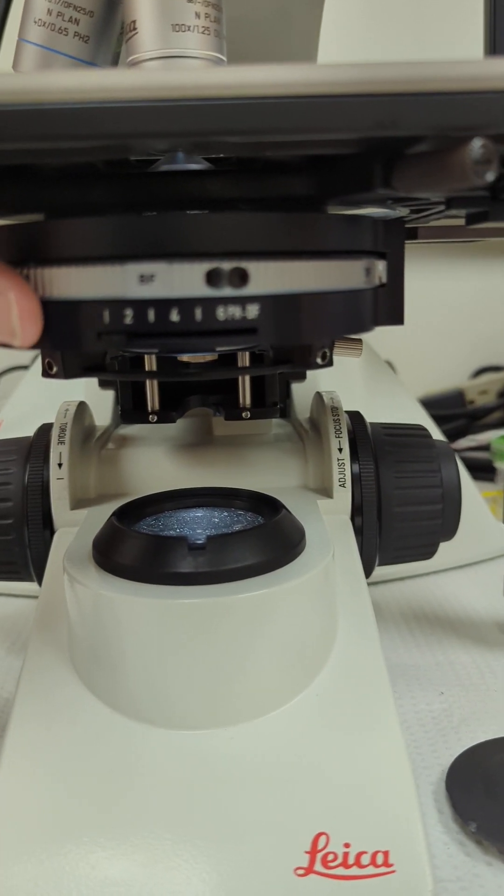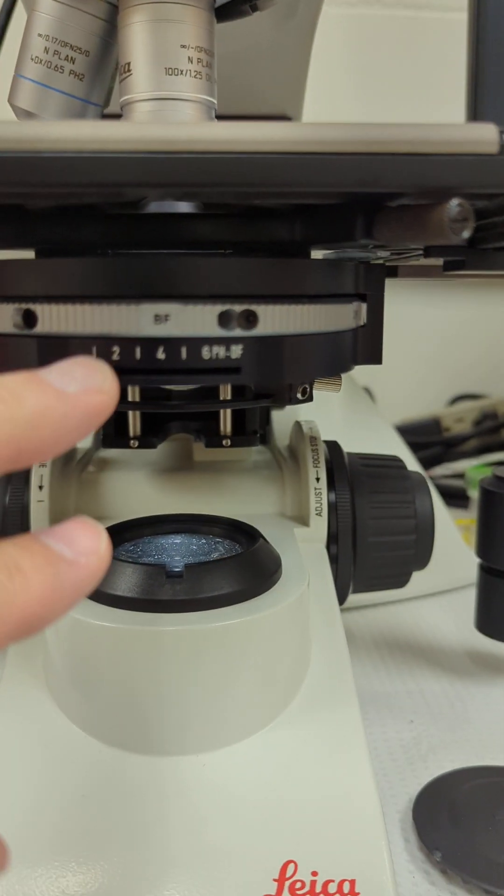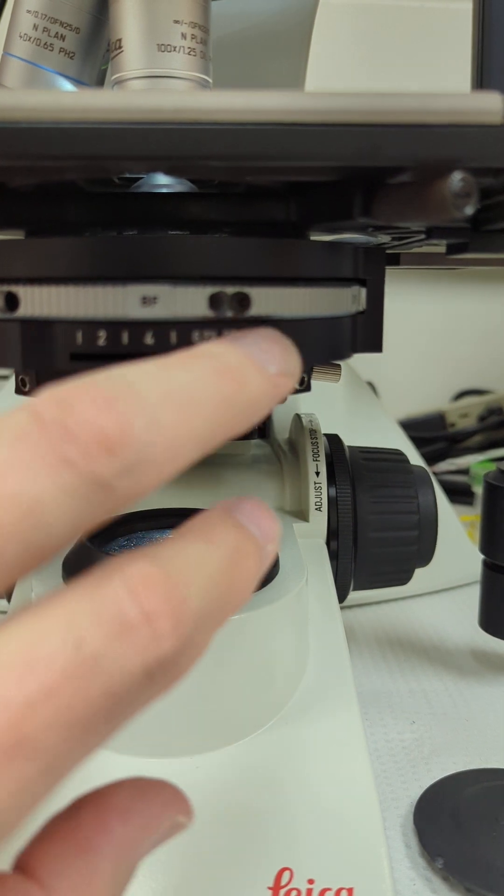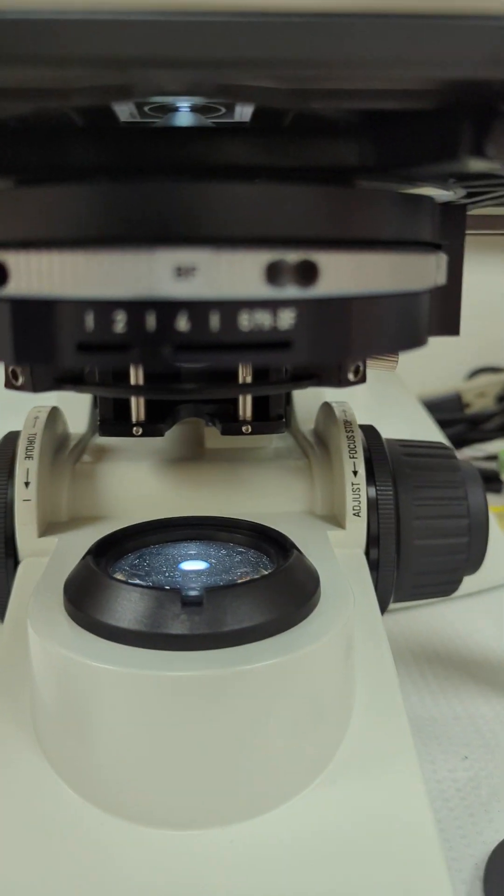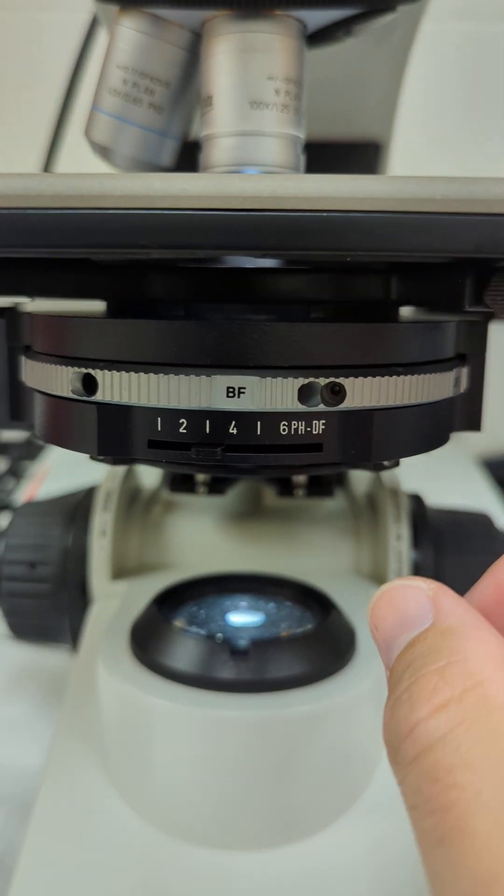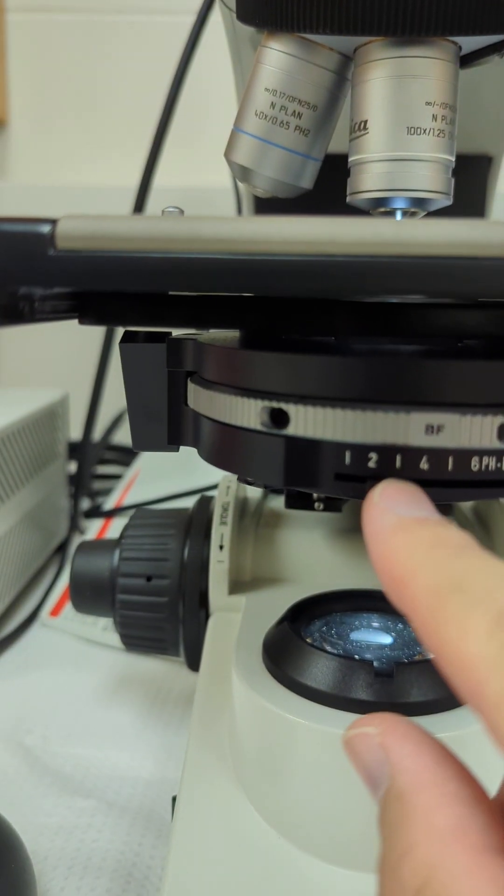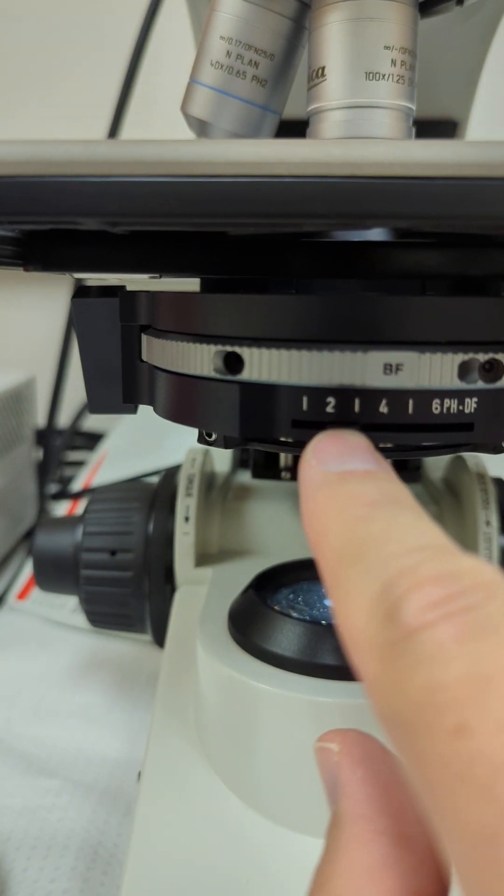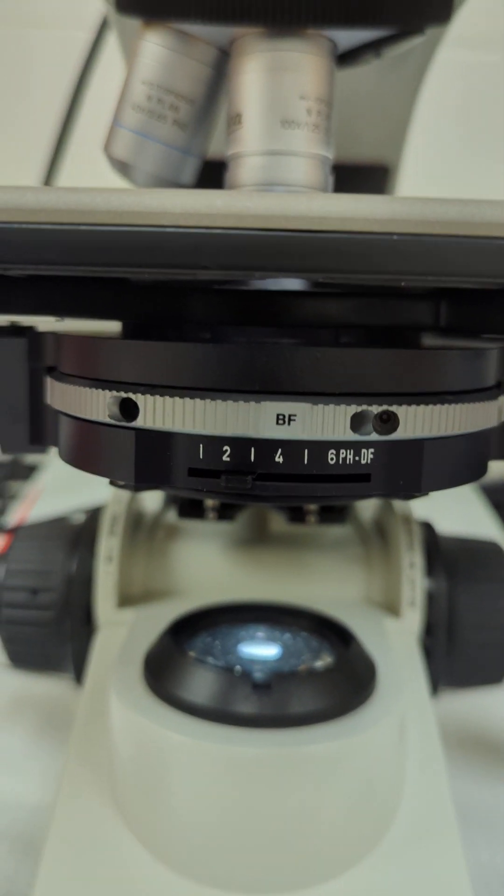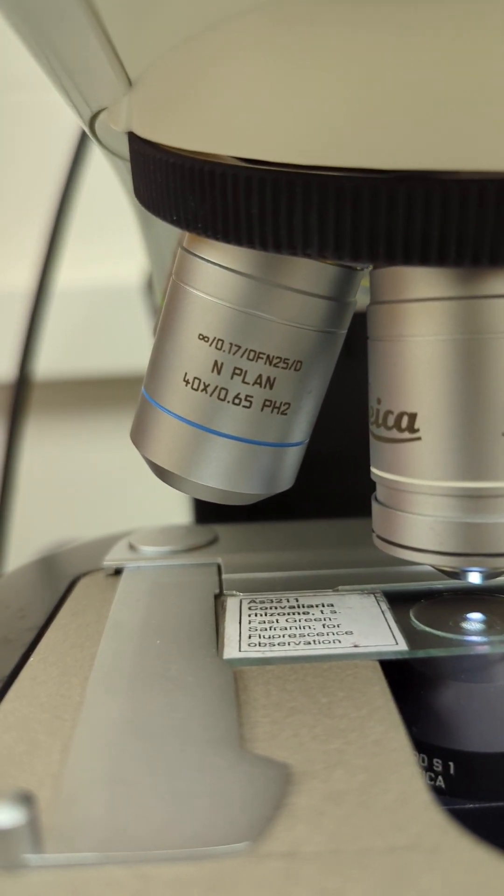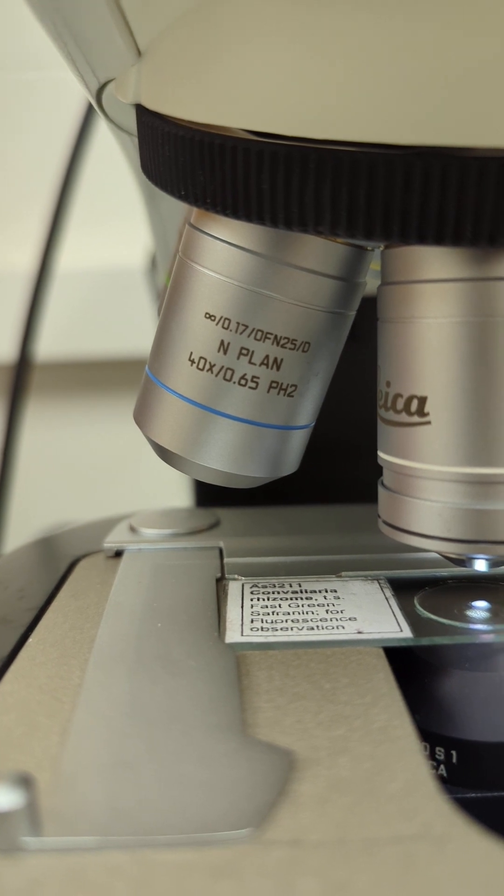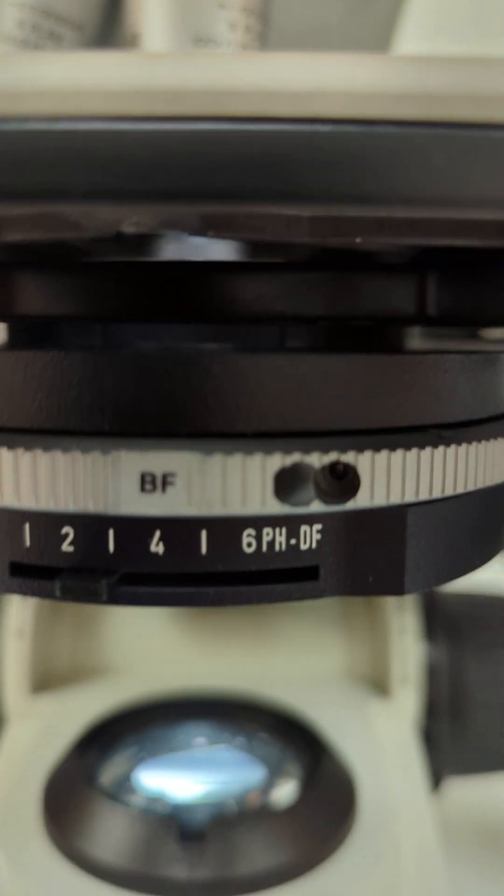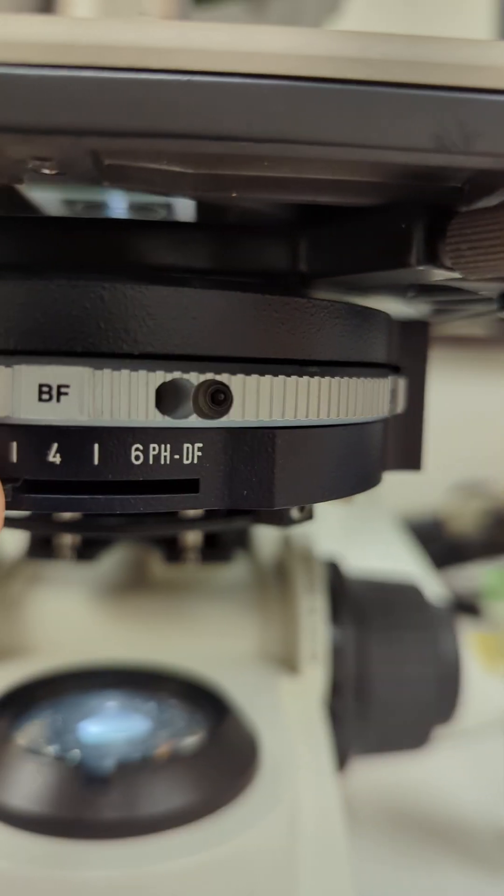You'll see right here there's a slider left and right. The slider correlates to either the brightfield, darkfield, or phase. So all your brightfield positions are here, and these numbers relate to what you see after the lens magnification. You see the 0.65, 40x, 0.65.